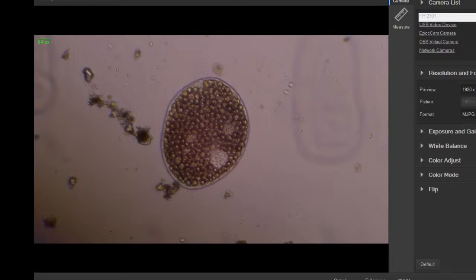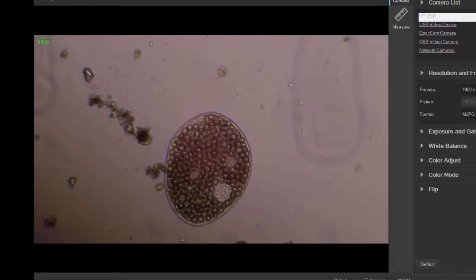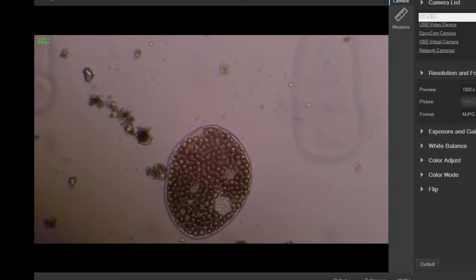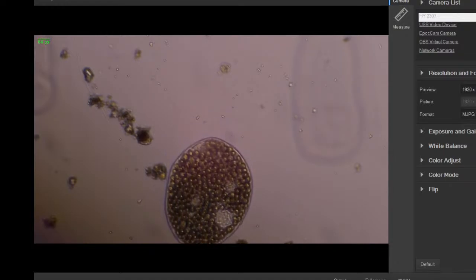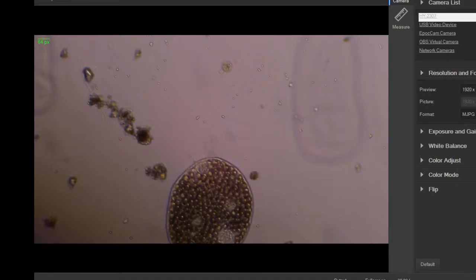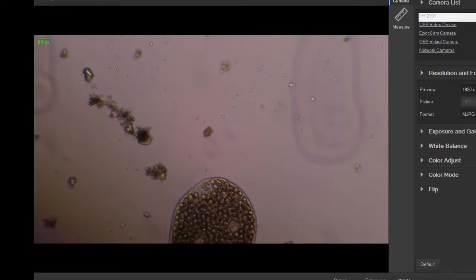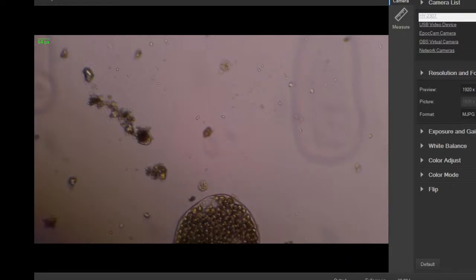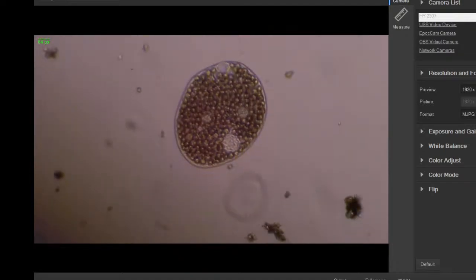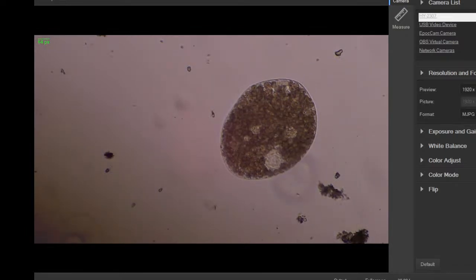So this was bottle number 2. I think it's bottle number 2. Is it bottle number 2? Yeah, it was bottle number 2, the one on the trail. It had some mud and other plant bits in it.